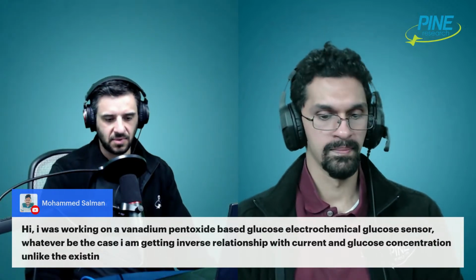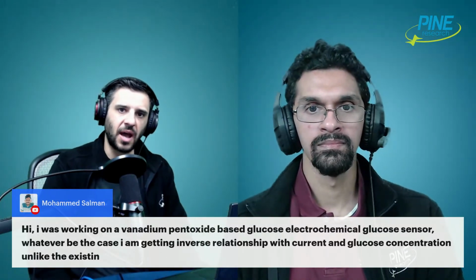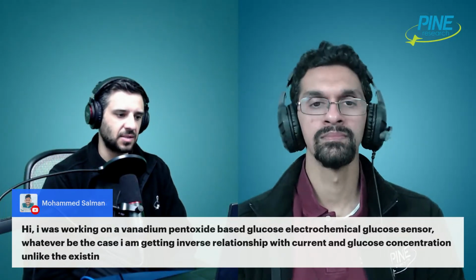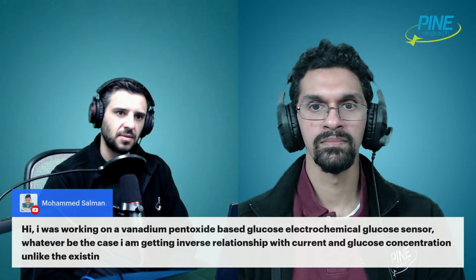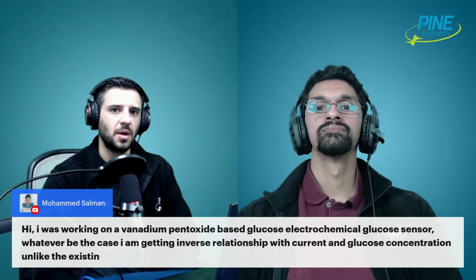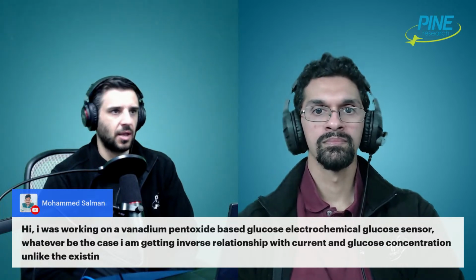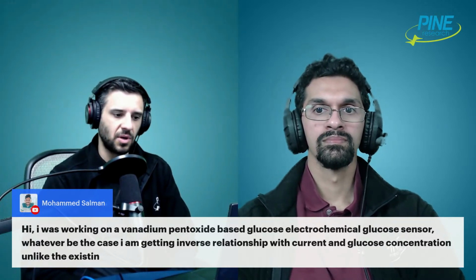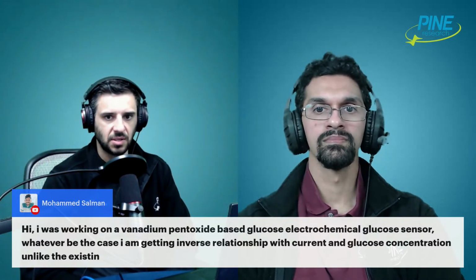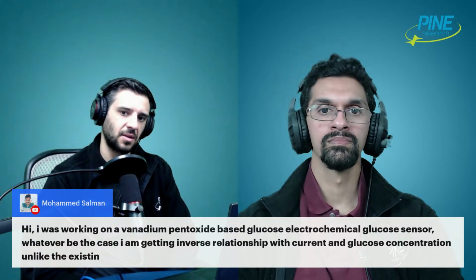But all I can think to say as general advice is to piggyback on what Alex just talked about. Make sure that things like the background current and capacitive effects, which can really get in the way of those kinds of measurements, are not severely impacting your measurements. There are all these follow-up questions I would need to know: whatever the applied potential is, whatever the current is, what's the reaction you're trying to study, what's the electrolyte concentration, what does your physical electrode look like and setup, are the leads connected right, or all these things.